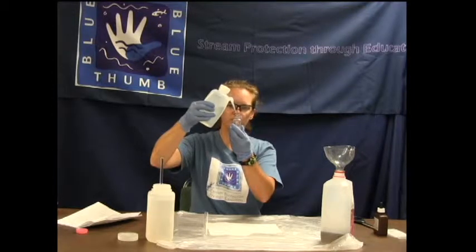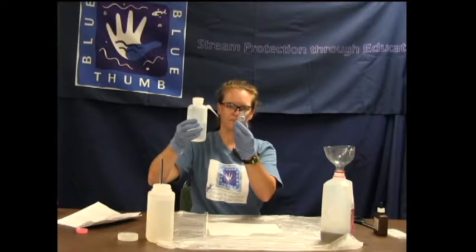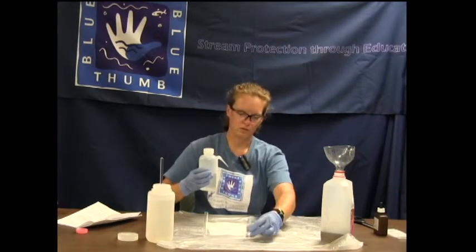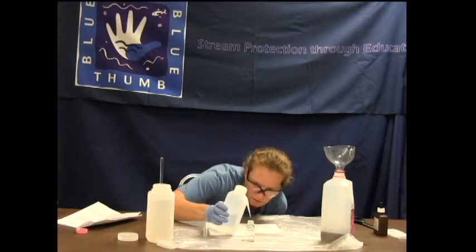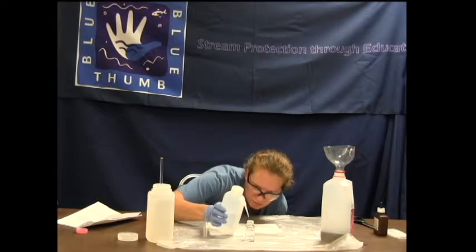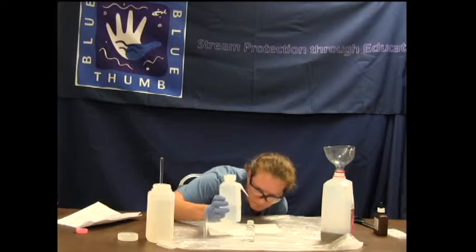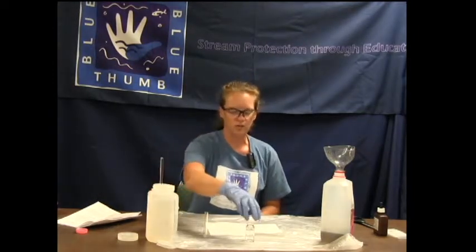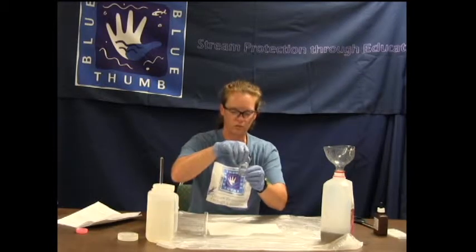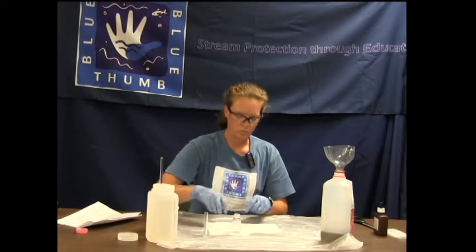Whether you hold the bottle or set it on a level tabletop, fill at eye level. I'm going to put mine down on the tabletop, so I need to scoot down a bit. At the 23 line, you want the very bottom of the water curve — the meniscus — to be touching that top 23 line. That's the proper way to fill it.